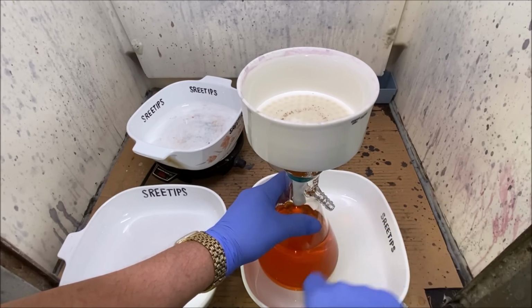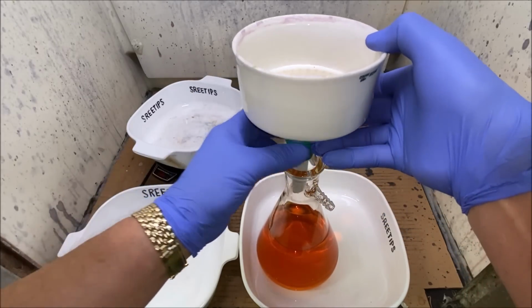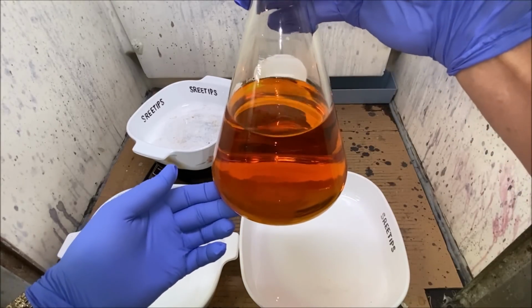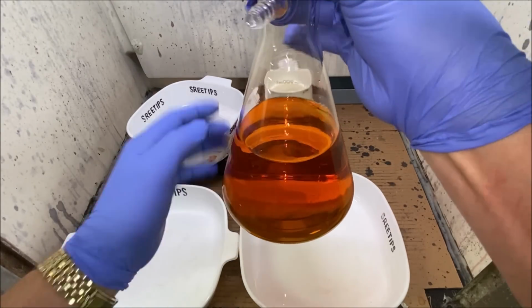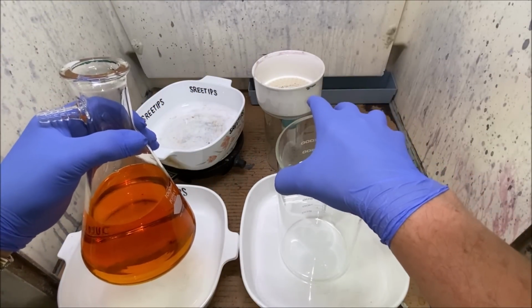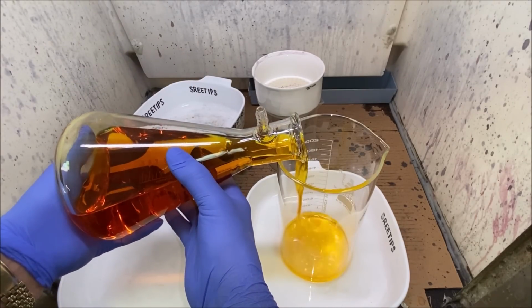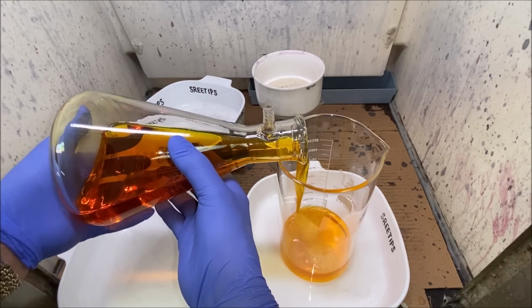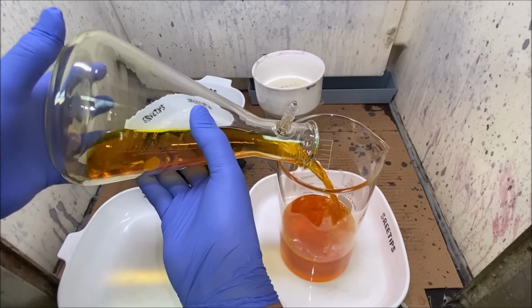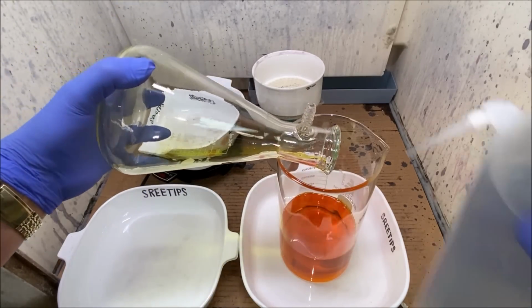It's getting late. I'm tired. And what we should probably do here is use ferrous sulfate, since I suspect there are platinum group metals in the solution. It's a burnt orange color rather than a bright orange color. It's nice and clear though. And to go for high purity, ferrous sulfate would be the proper choice. But it'd take another hour to get that all prepared and another hour to rinse all the ferrous sulfate off the gold. So we're just going to pour it in this beaker and do good old-fashioned sodium metabisulfite precipitation.